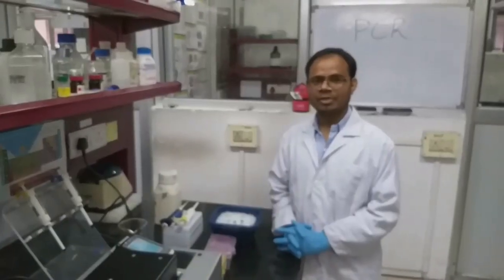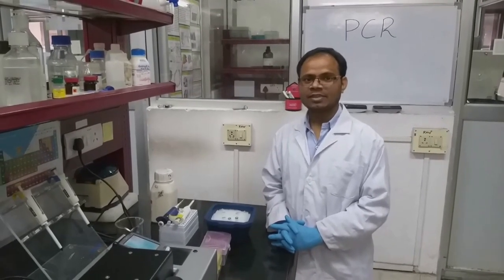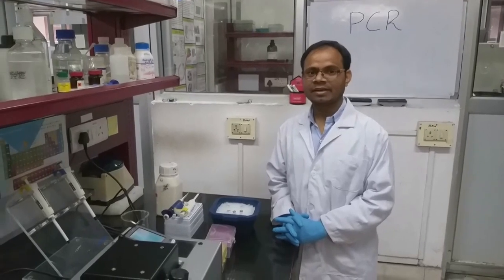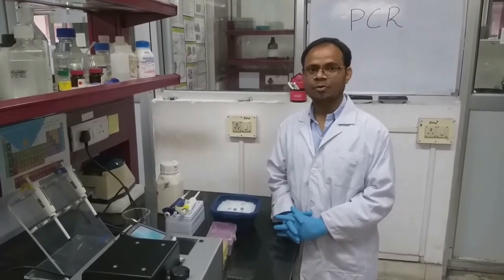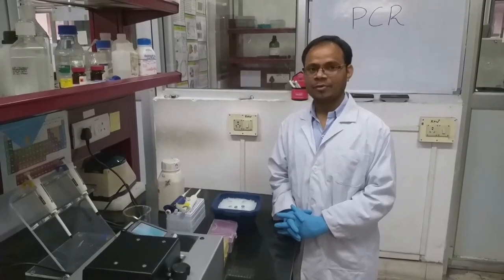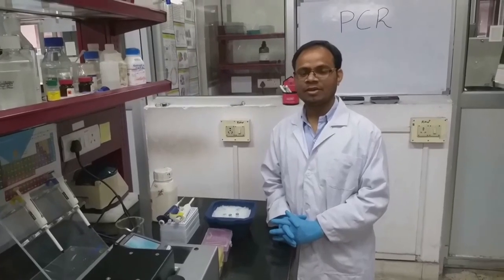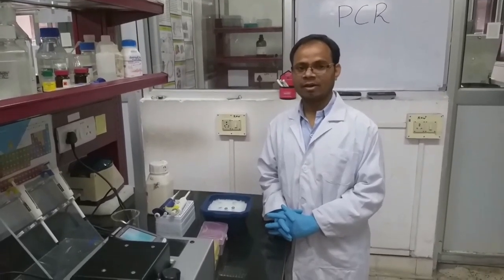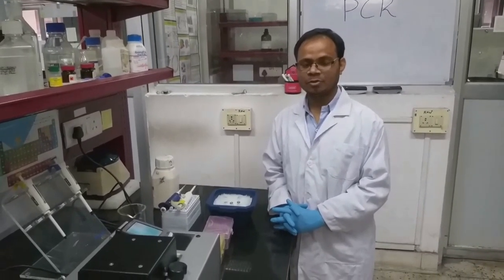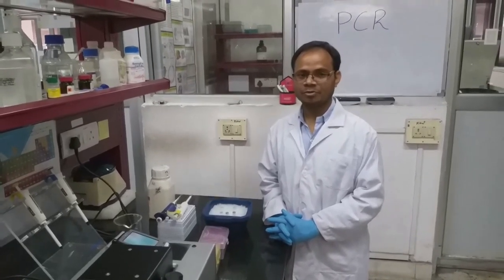To set up a PCR reaction, we need template DNA, site-specific primers, dNTP mix, nuclease-free water, and Taq polymerase. For a 50 microliter reaction, typically 10 to 100 nanograms of template DNA is used, and 5 picomoles of each primer will be used.